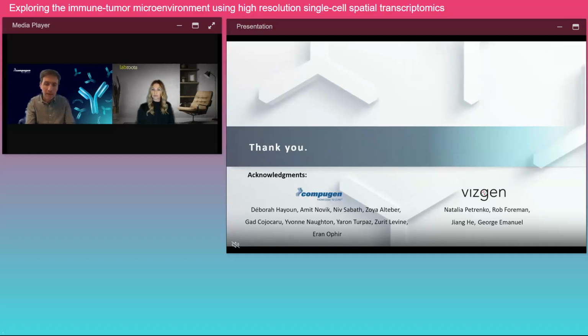And we've done this exercise. We took single cell data, and then we tried to map it with the intersection between the genes, and it came out relatively good. I believe that in the future, we will be using a broader panel, and then this test will become easier because we'll have more intersection between the two types of cells. So that's something we aim to improve. But it's doable also with the current panel, but not every cell can do this.